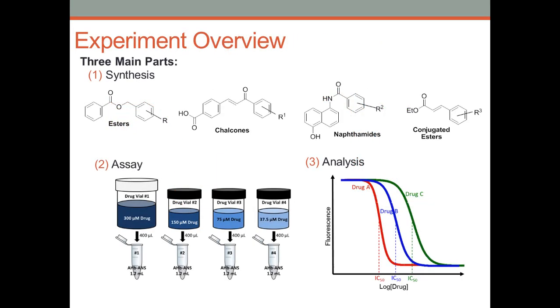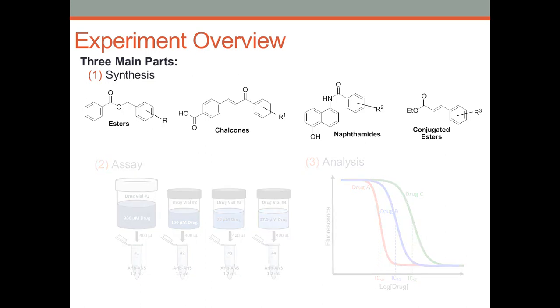Alright, so that's all of the background. So again, remember that the big picture here is that there are three main parts: the synthesis, the assay, and the analysis. So this first day, you're just going to perform the synthesis of your drug, so let's get to that.